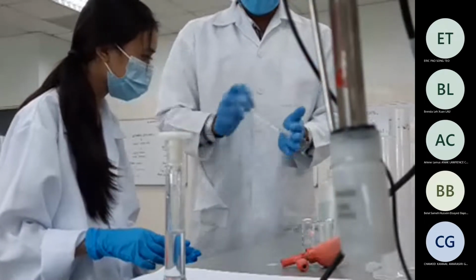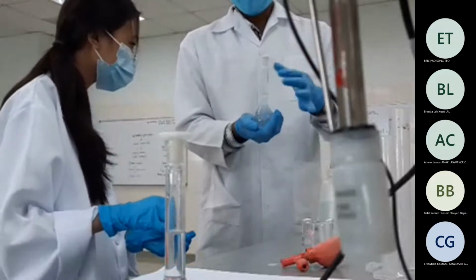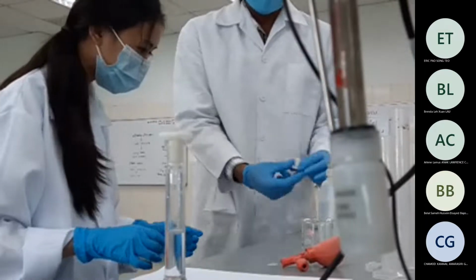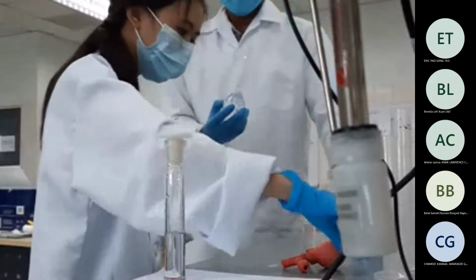So shake it like this. And you see that the water is mixed. Now use the dropper to add drop-wise. Make the, yeah. To the top, yeah.